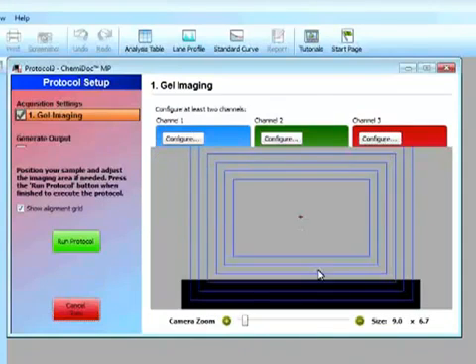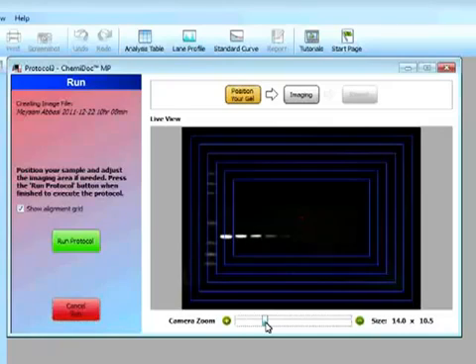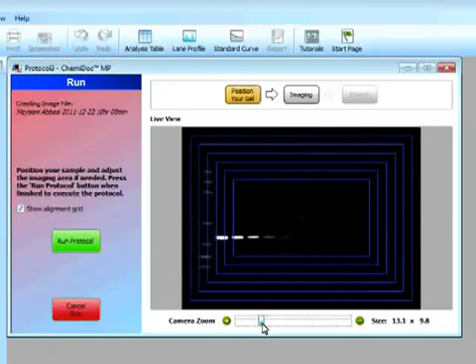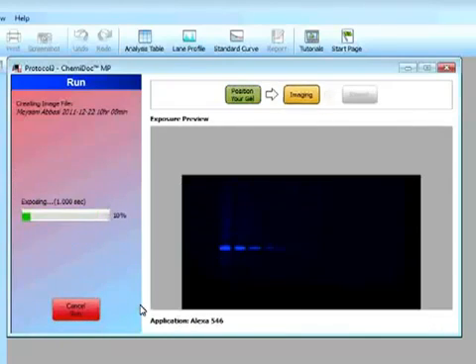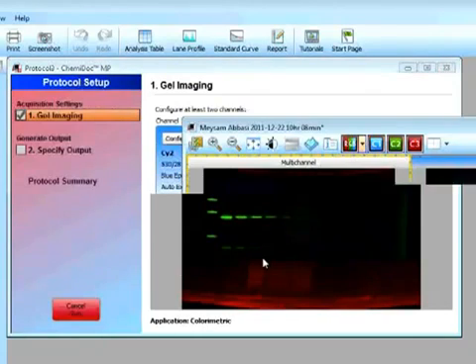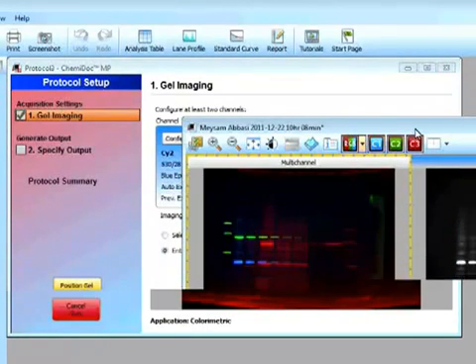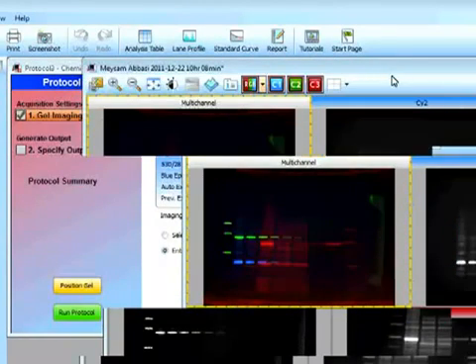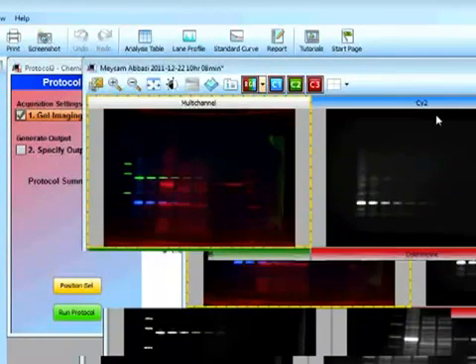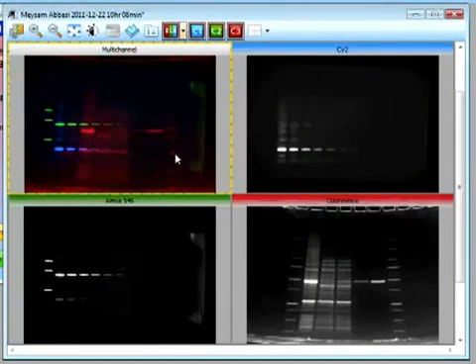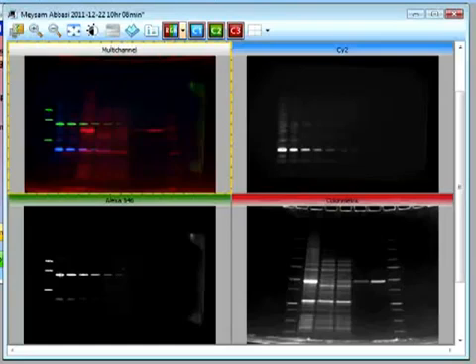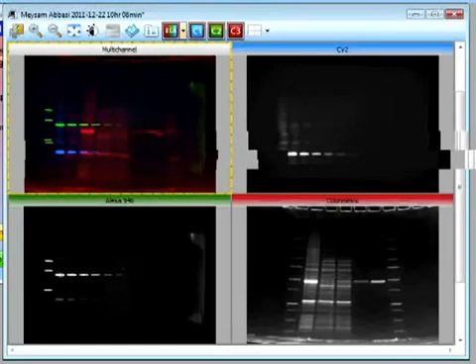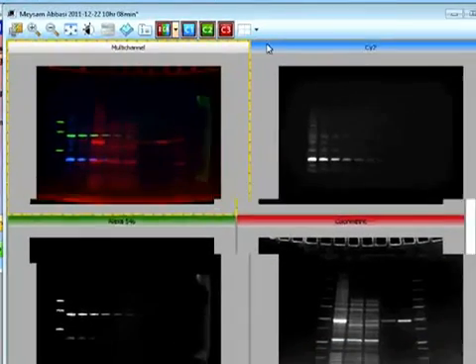Again, we will position our gel. Zoom out. And then click on run protocol. So now we can first see the image from channel 1, and then channel 2, and channel 3. So you can see that we have the multi-channel image. We have the Cy2, Alexa 546, and the colorimetric, where we can basically see our protein standards.